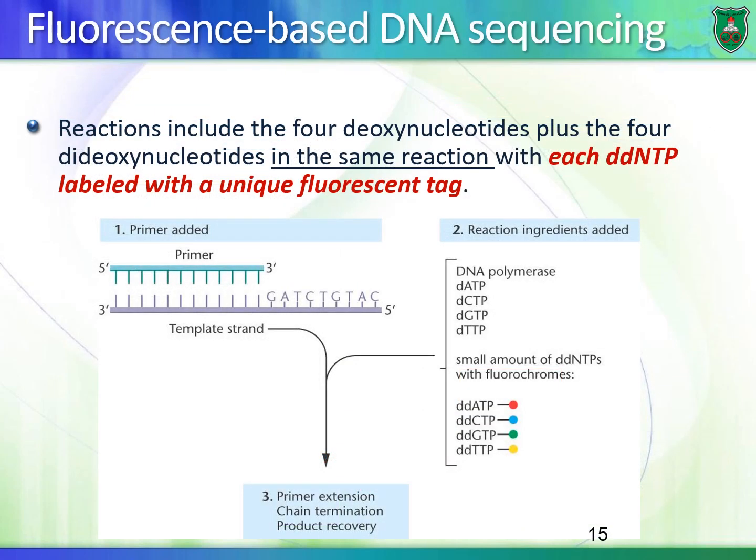Now, the thing about DNA sequences that I just talked about is that we're using radioactive primers, or radioactive labeling of primers, and radioactivity is really harmful for our cells and our DNA. And it is expensive and laborious. It takes a lot of time to do DNA sequencing using radioactivity. So scientists said, and we used to do it manually, reading those gels that I just showed you.